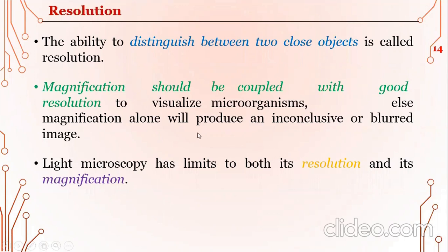So magnification is important, but resolution is also important. Resolution is like pixels, so pixels are also important.